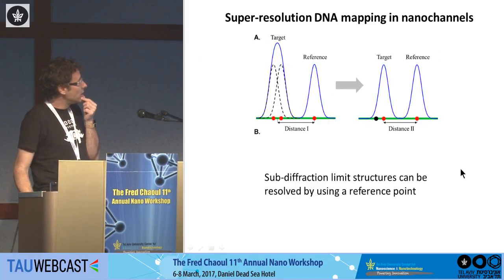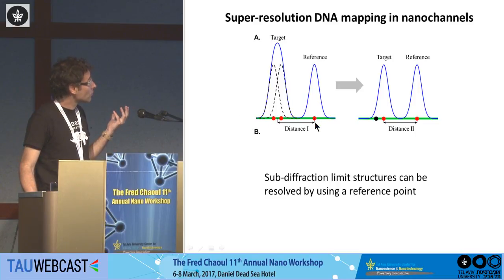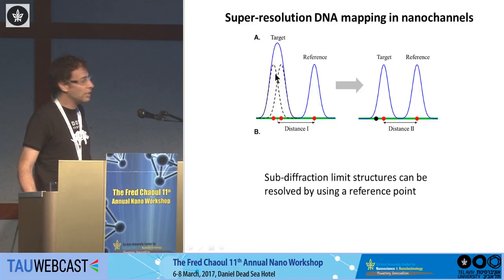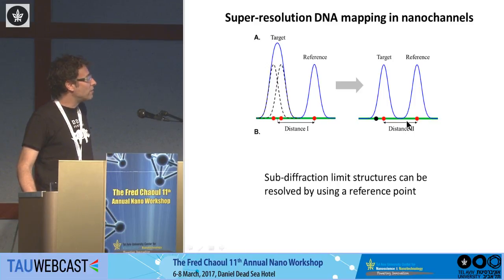Again, what Jonathan did here is to go to distance measurements instead of localization measurements. Think of the following case. We have here a stable anchor fluorescent marker. And here we have this pair of fluorophores. Each one of them is emitting a Gaussian-shaped profile. Because they are close together, these Gaussians are summed, and what we see is a single Gaussian-like intensity distribution with a centroid, if we fit a 2D Gaussian, which is exactly in between the two. So if we measure the distance between these two, we get a certain distance. At a certain time, one of these molecules is going to die, it's going to bleach. What's going to happen is now we only have the contribution from the right molecule. So this Gaussian has shifted and came closer to the second Gaussian. If we measure the distance now, the difference between these distances is exactly half the distance between these two fluorophores.